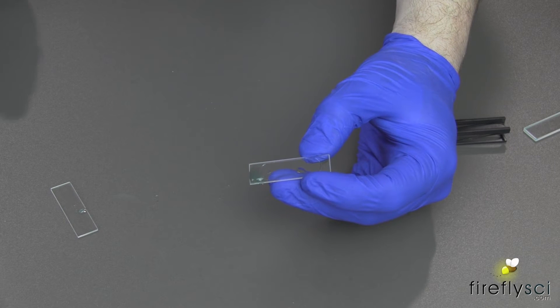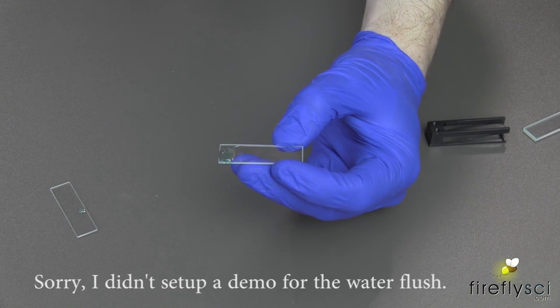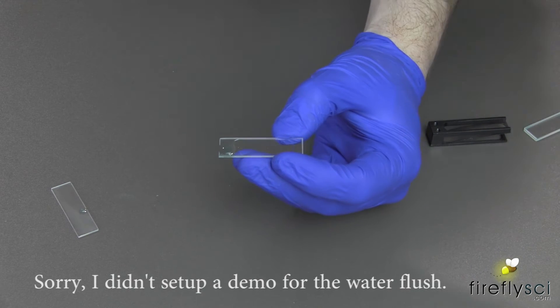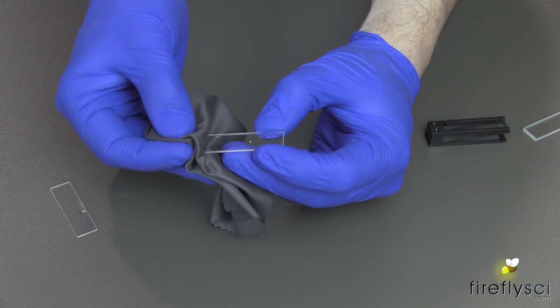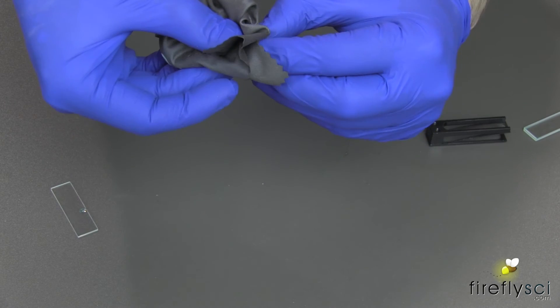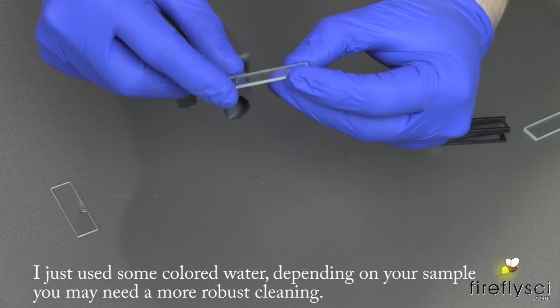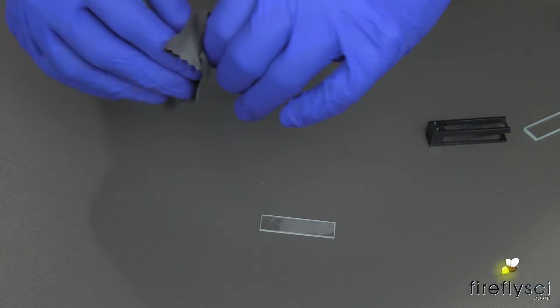Since it can be taken apart, it's really easy to clean. One way to clean this cell is to flush the cuvette with purified water and dry on the cell rack or with a lens cloth. I'm going to go ahead and use a lens cloth for this one since it's just a small dot on the end — just suck it right up. Then go ahead and wipe down the groove plate and also the cover plate as well.